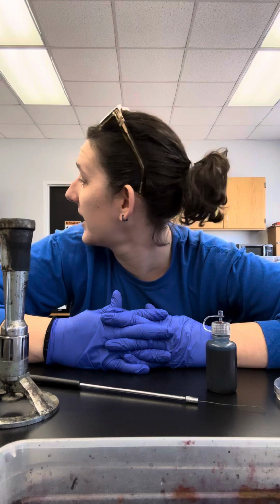So I have had a student request that I do a video demo for all of what we've done so far, all the different stains we've done so far.